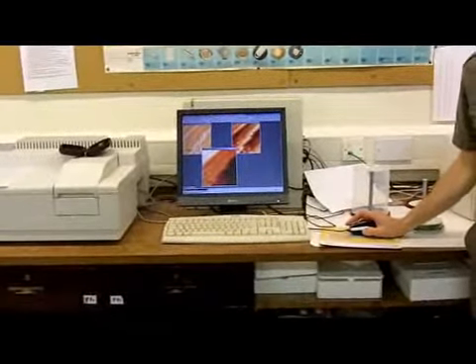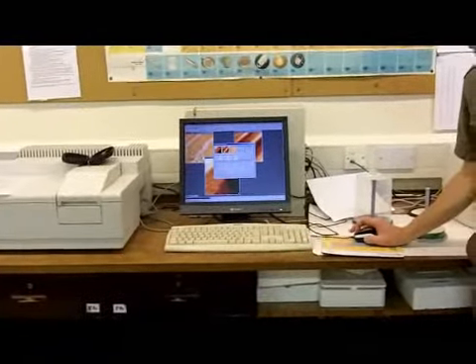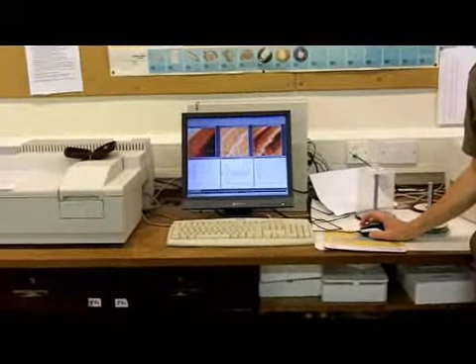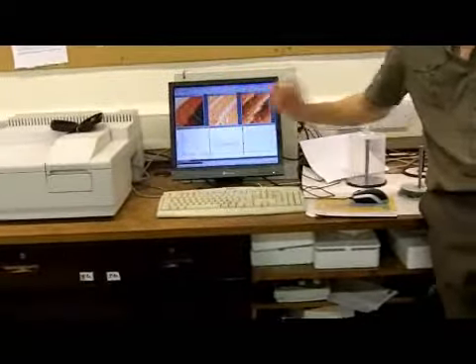And we can see the effect of that even better if we do a profile. So again, I'll do a multiple profile. I'll choose all three images. Say OK. And draw a profile down the middle. There we go. And you can see now you've got a flat terrace. You can measure heights on that nice and easily.